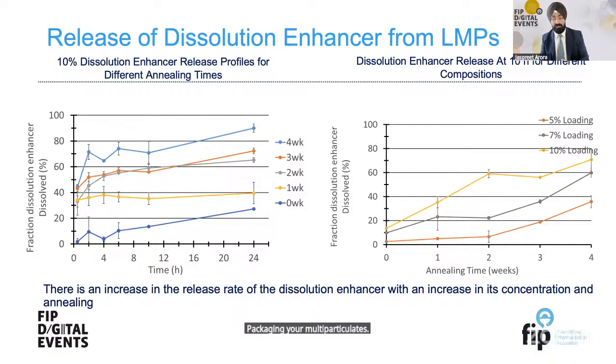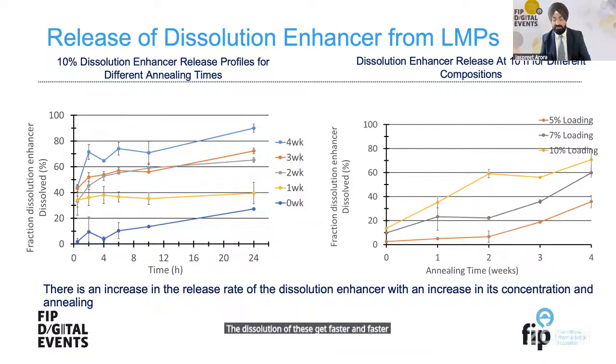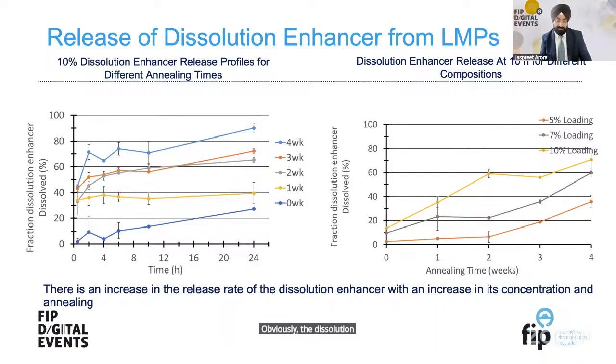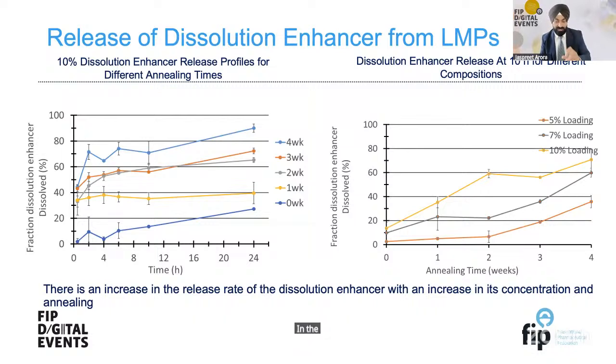This is where you see that as you keep annealing these multi-particulates, the dissolution of these gets faster and faster, depending on some formulations. And obviously the dissolution kinetics differ as you increase the pore former or dissolution enhancer ratio in the formulation. So that acts as a handle as well.